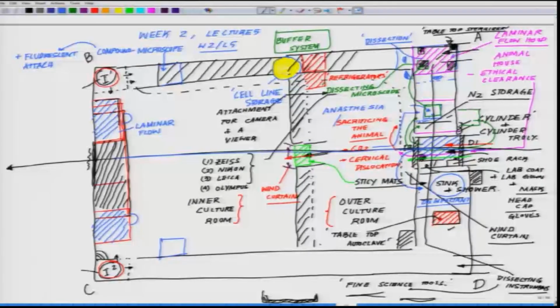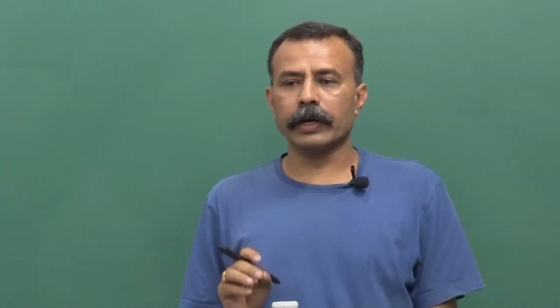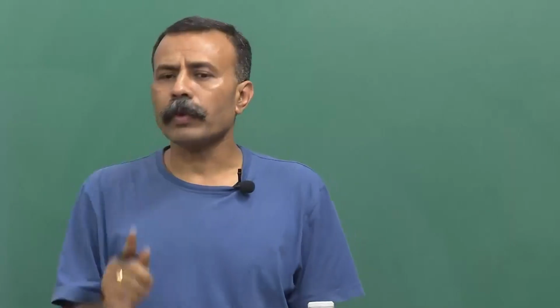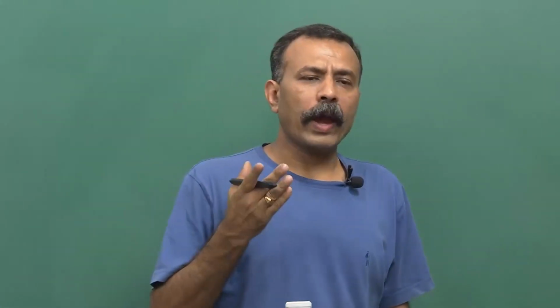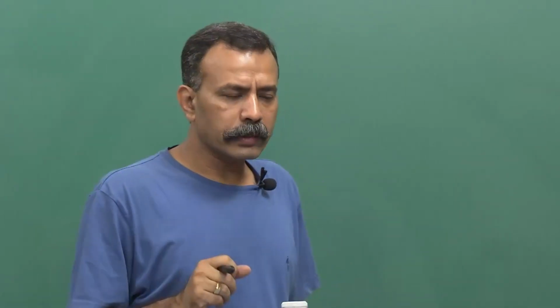That I will leave it to your requirements and to your wisdom, because that decision only you can take, whether you want a fluorescent attachment or not. But what I will recommend here is something else: where you are plating the cells. That is important. Why is that important?